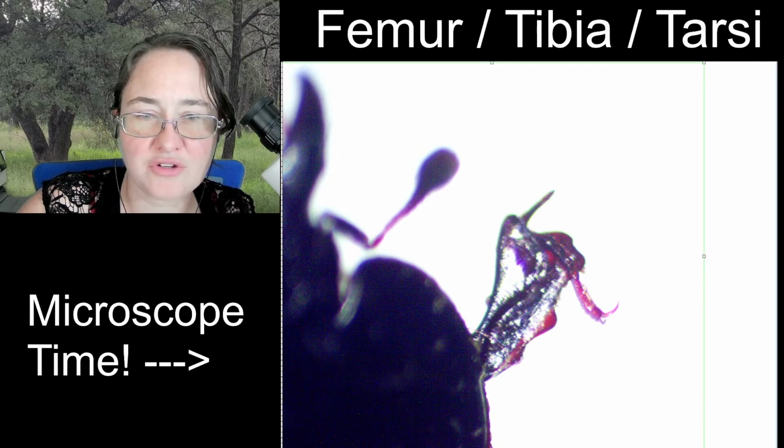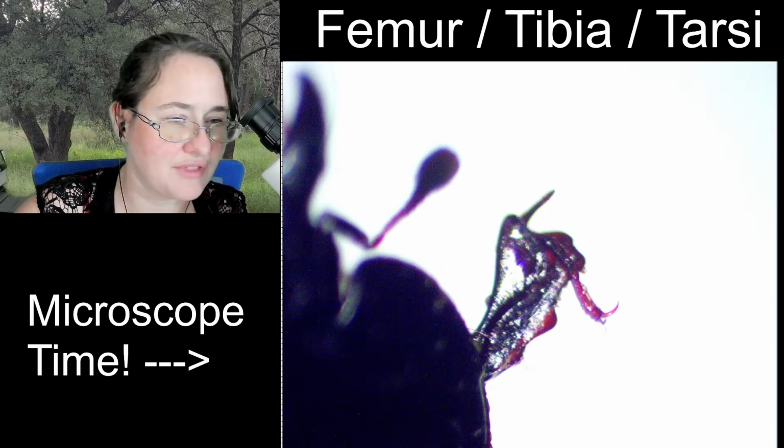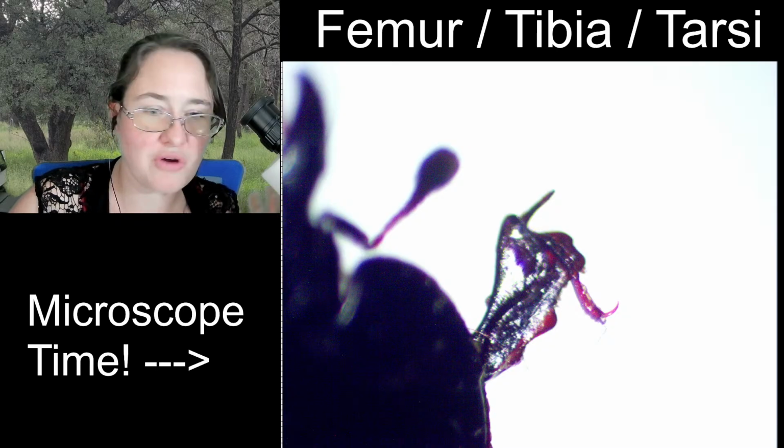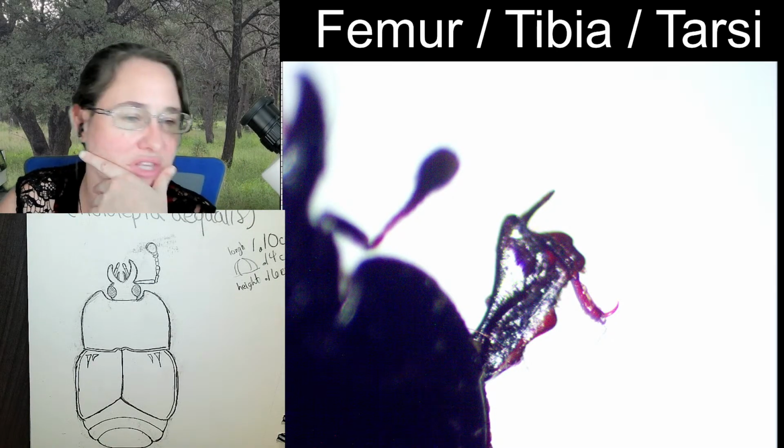Oh yeah, an auto exposure bag, so that it's not blaring everything out. Perfect. Love it. So we had to rotate this beetle just a little bit so that we could see it in its entirety.